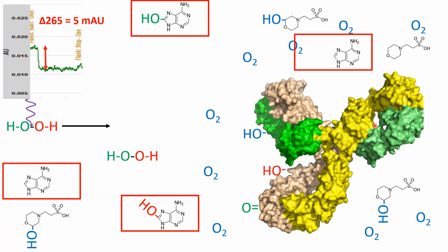The traditional way would be to take my protein and sodium phosphate buffer and add in a radical scavenger until I match the scavenging capacity of the citrate buffer. However, as you can see here in the oxidized protein, when I have a higher radical scavenging background for the same amount of radical, I get fewer oxidations on the surface of my protein.